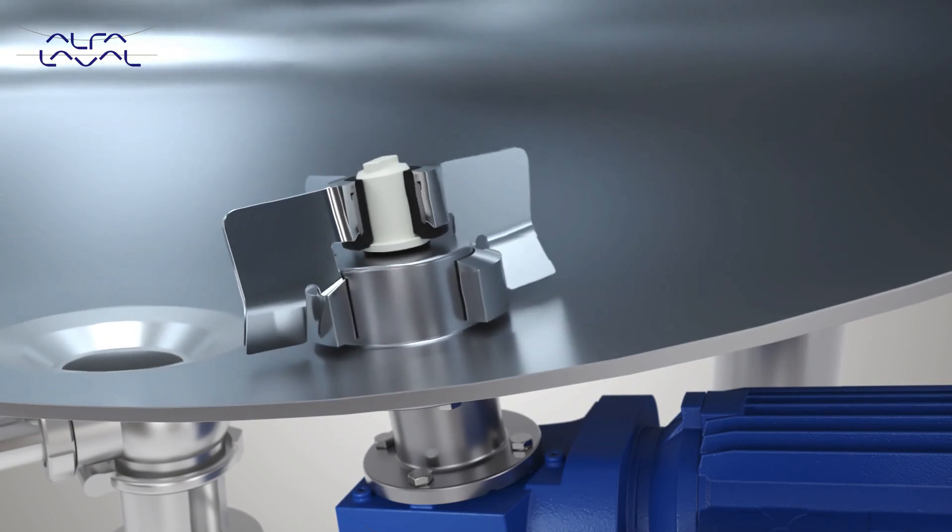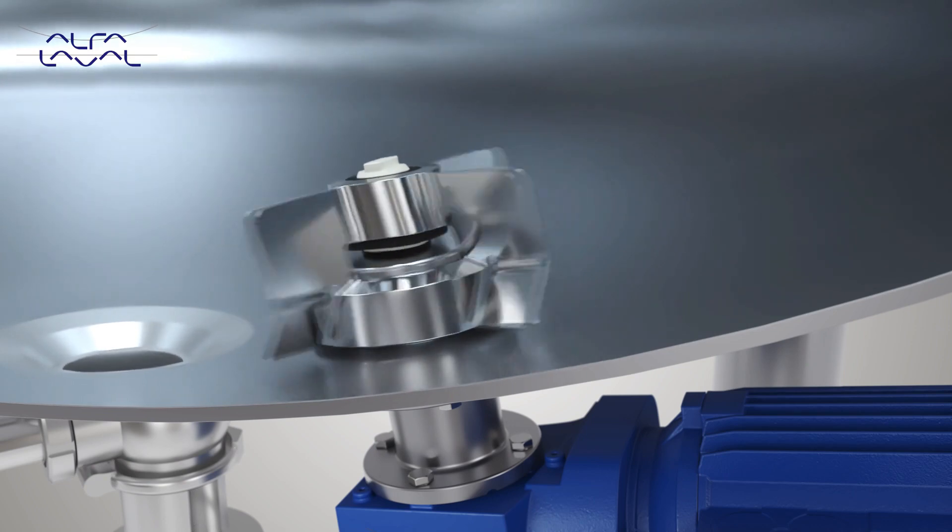of the Alfa Laval LeviMag levitating impellers ensures no direct contact between the axial parts of the bearings. This eliminates pressure that would normally build up between bearings when the RPM is increasing, securing gentle product treatment within food, dairy, and beverage applications.